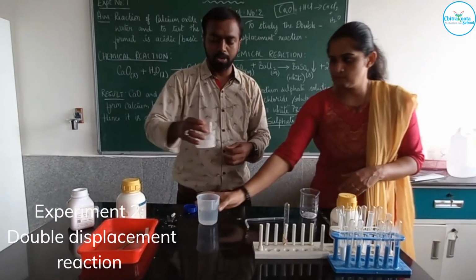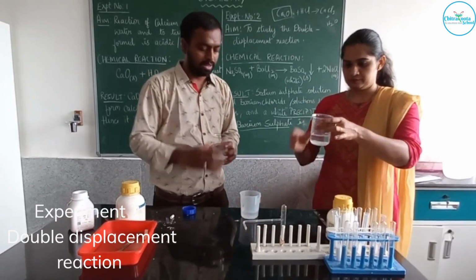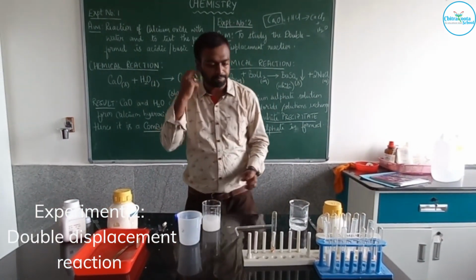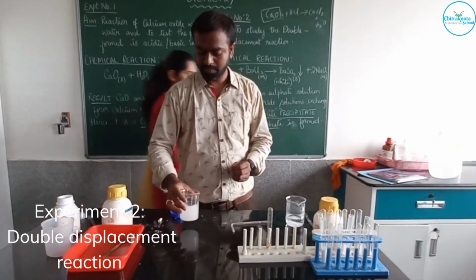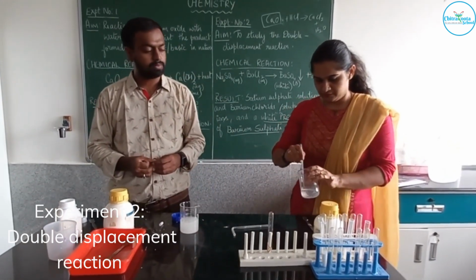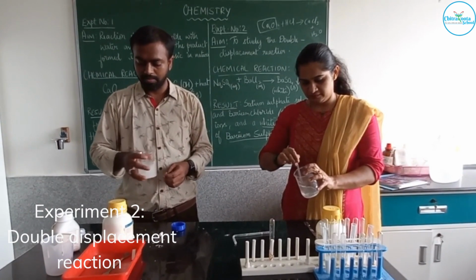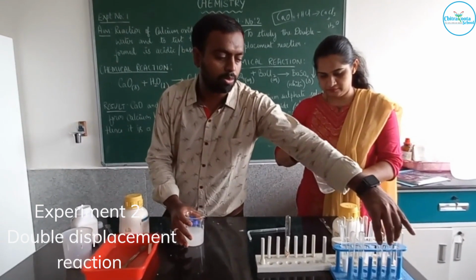Fine. We are just trying to make a salt solution. This is sodium sulfate. There, we can take a glass. Can I use the same glass to prepare this solution? No. What will happen? They will react. Yes, they react, and before you try to mix them, the product would have become something else.